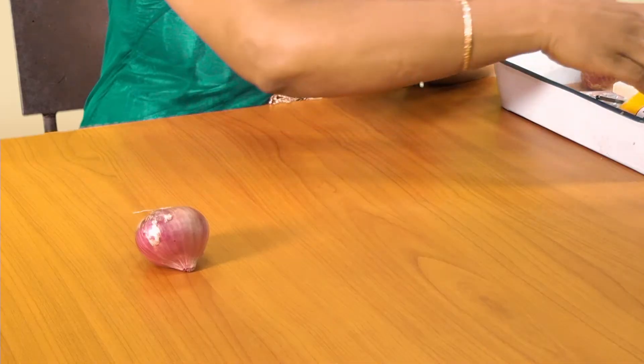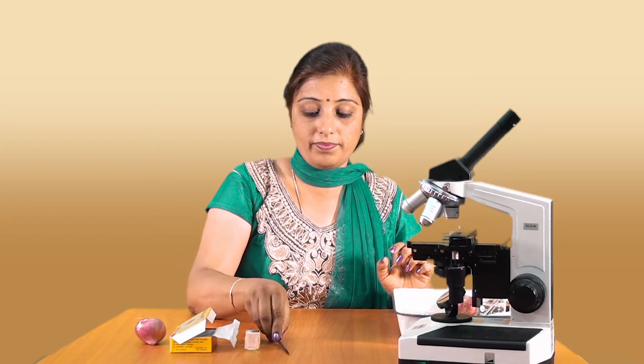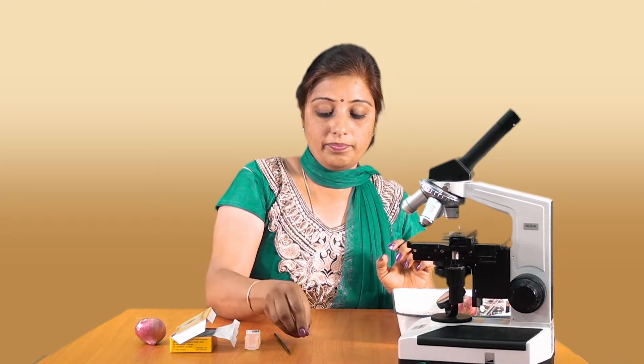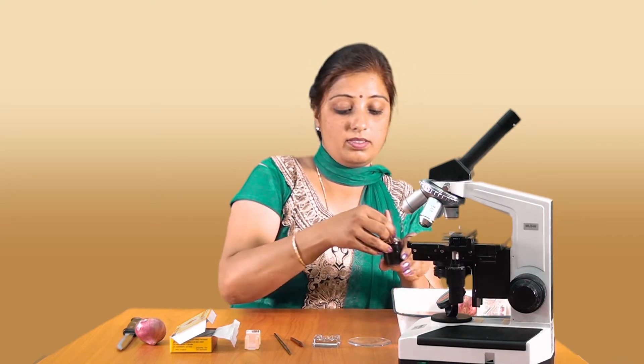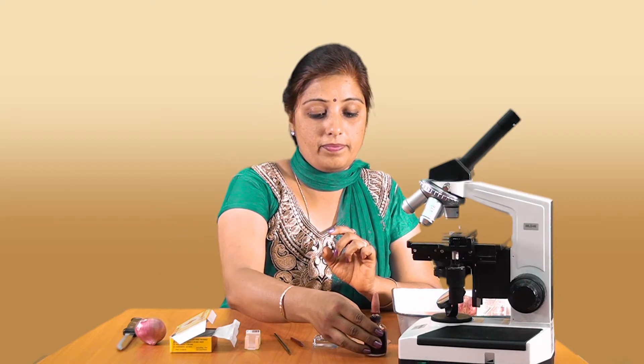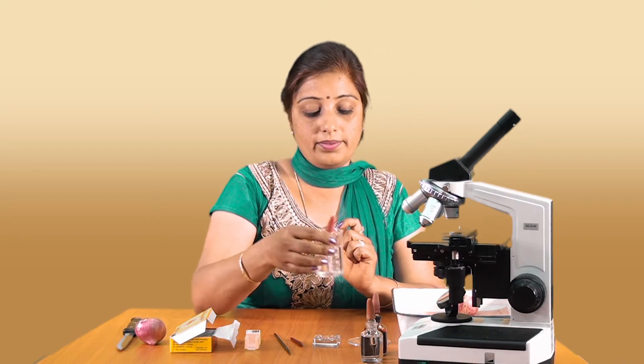For that, the materials required are: the onion, micro slides, cover slip, brush, needle, kitchen knife, an embryo cup, a watch glass, saffronin stain, glycerin, water, a few blotters, and blotting papers.